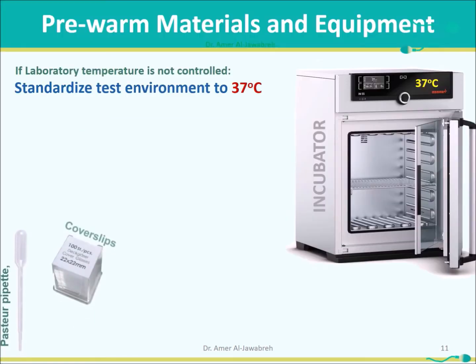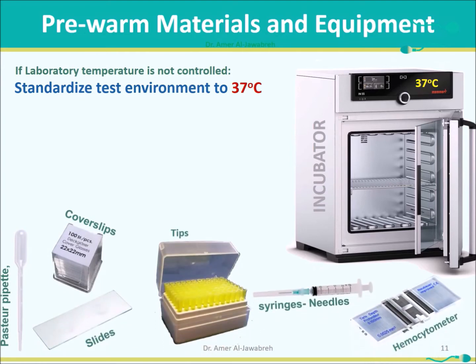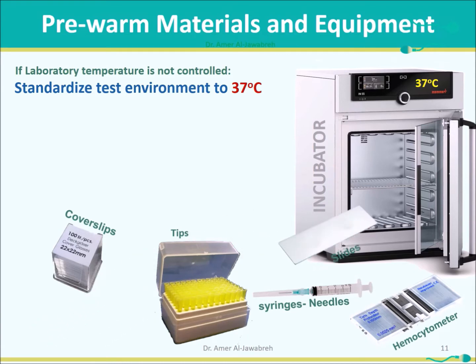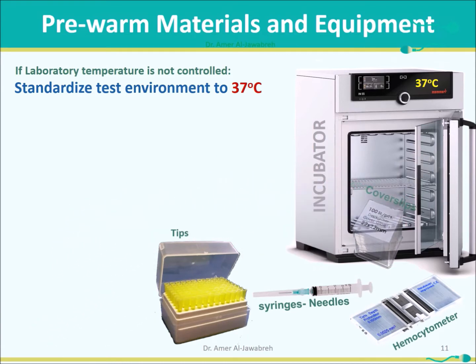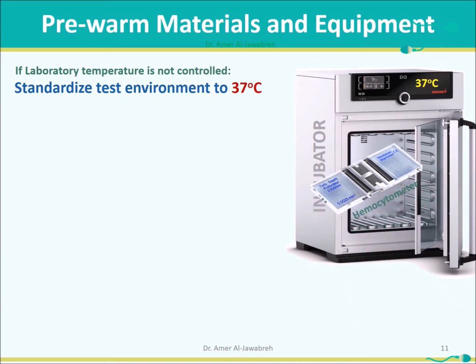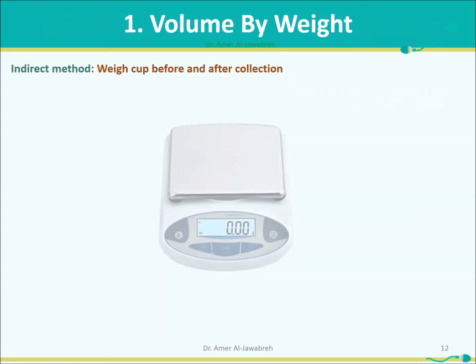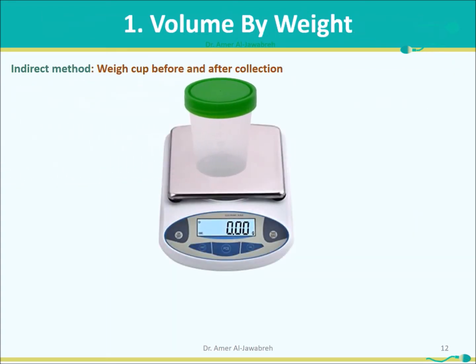Pre-warm materials and equipment. If laboratory temperature is not controlled, standardize the test environment to 37 degrees by putting all disposables and materials in the incubator. Volume by weight: weigh the container before and after collection. Take the difference between the two weights.